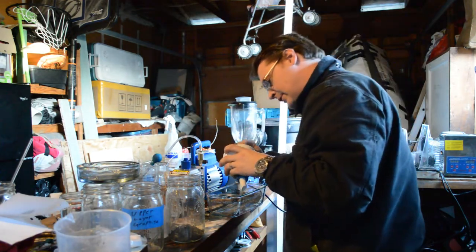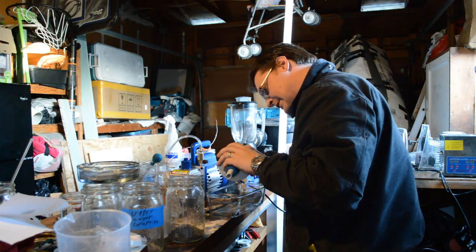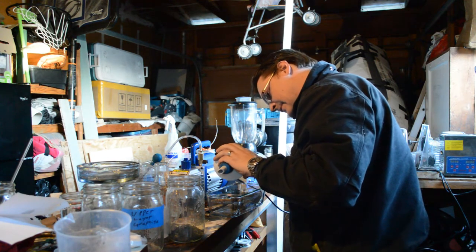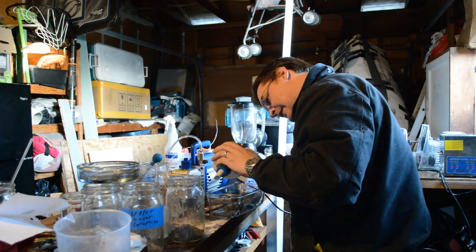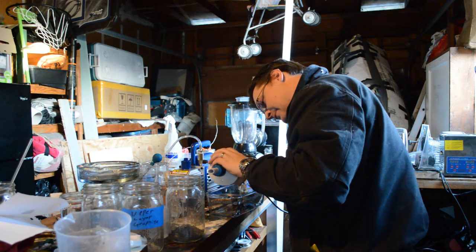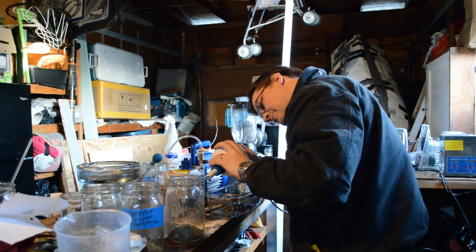Now I'm just transferring all that stuff I just got done siphoning off. And then I got to break it up a little bit because it dries faster when it's broke up. It doesn't hold onto the moisture as bad.